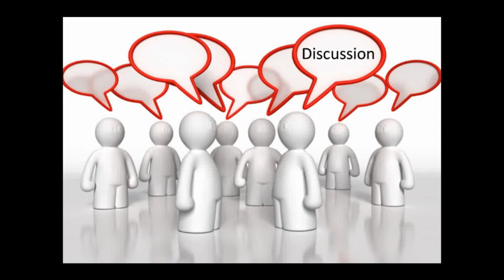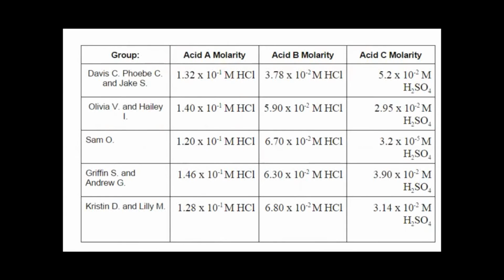Discussion. Looking at the data, compared to other groups, the molarities for acid B and C are different. Personal errors such as not completely drying the flask out after use may have diluted or neutralized acid during the procedures, resulting in a lower molarity.